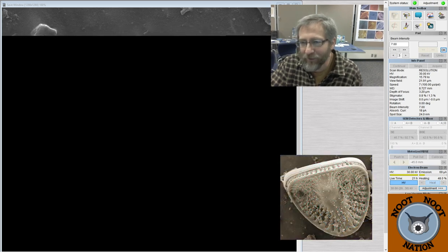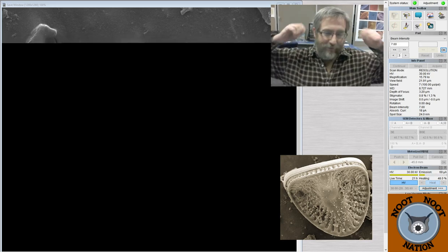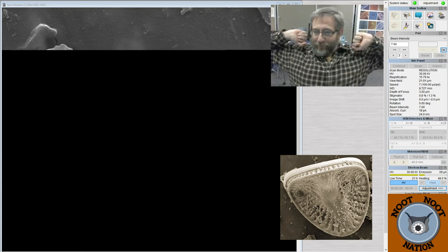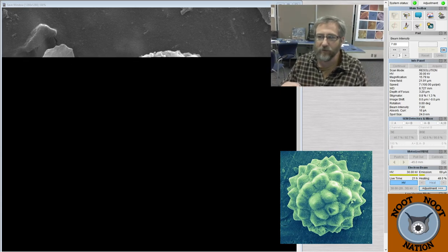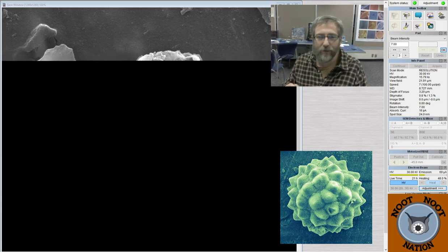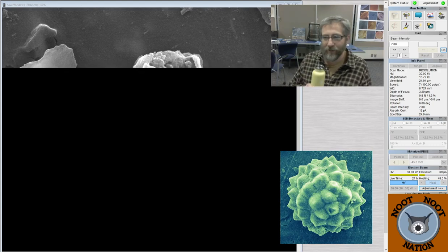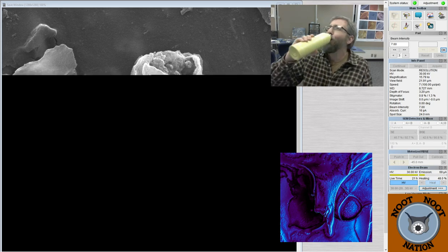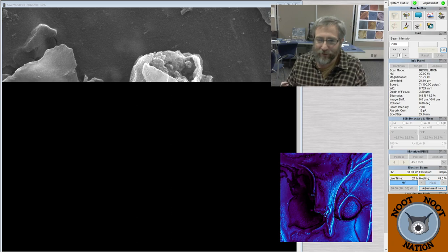Lunch is accomplished. Yeah, it's a little knobbly, tentacle-looking phytolith. I don't think it was an average size. 125 microns? That's not average for navicula, is it? Or did you mean something different?